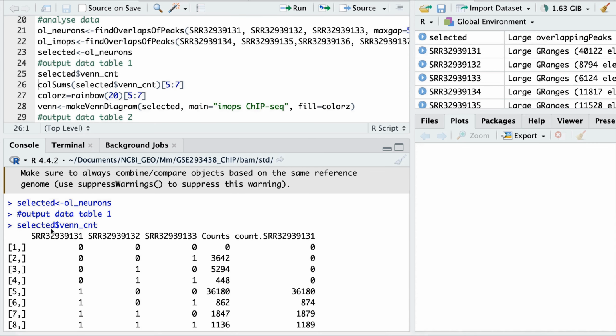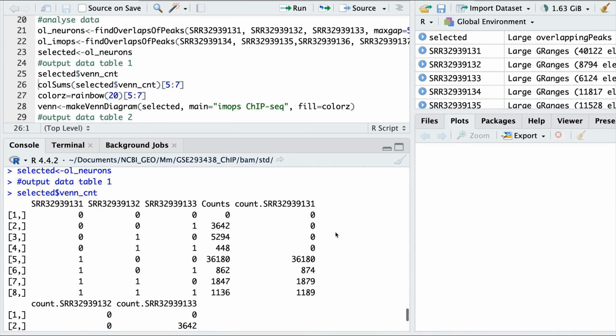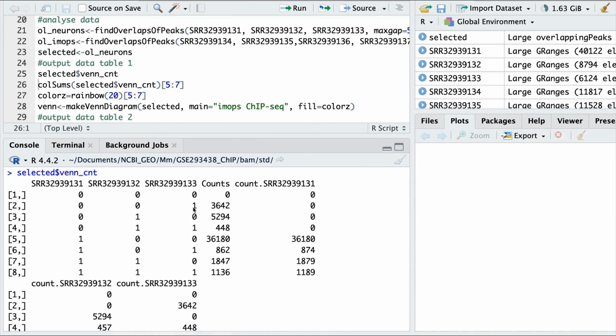And now I call the Venn counts, and this is the table. The first 3 columns are those famous combinations, present, absent. And then we see that, for instance, set number 3 alone shows this number, specific only for this set. Set number 2 has these numbers, in combination that one, number 1 alone this one.